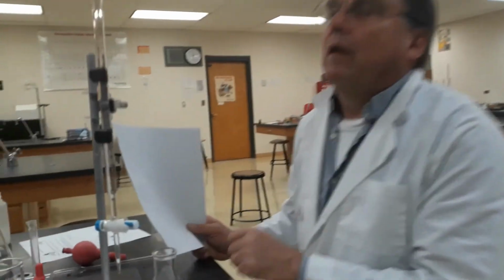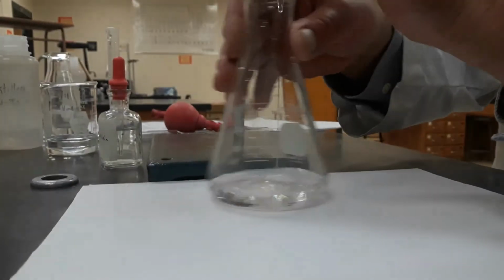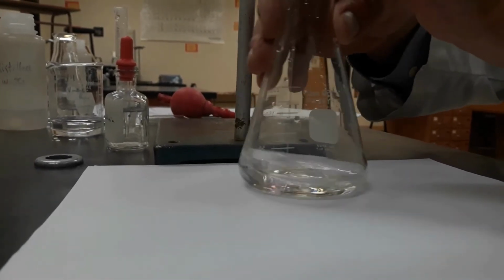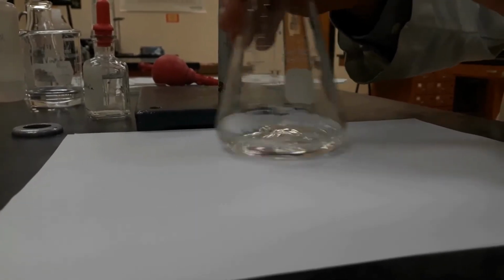So here's titration 3, your initial reading. And then we titrate. See if you can predict what the final reading would be. I know I am.